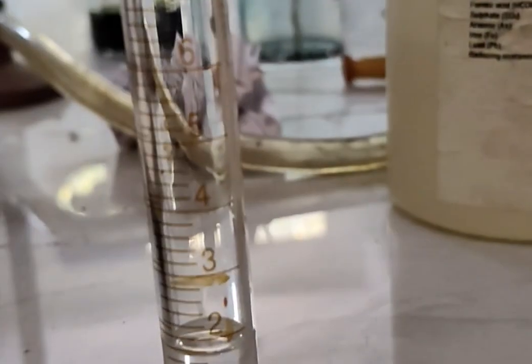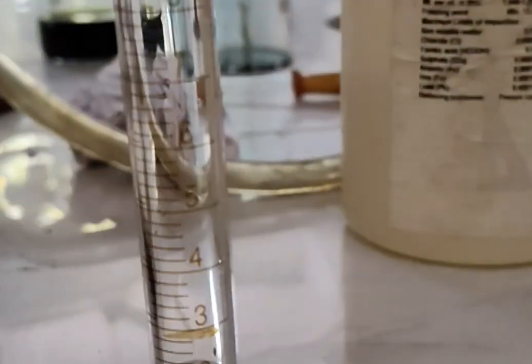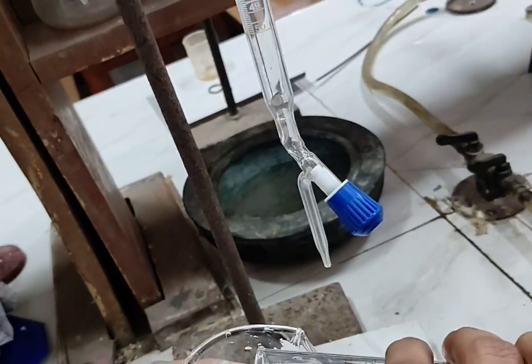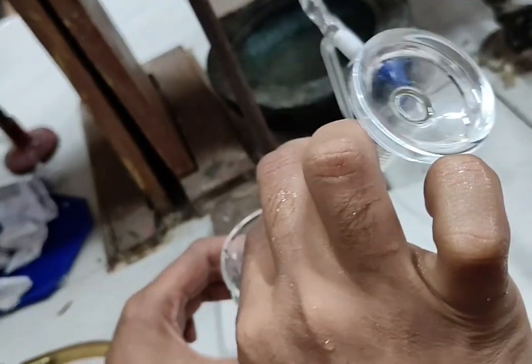Now we are making 1 ml of acetic acid solution with the help of distilled water in this beaker. This is the acetic acid solution that we have prepared.